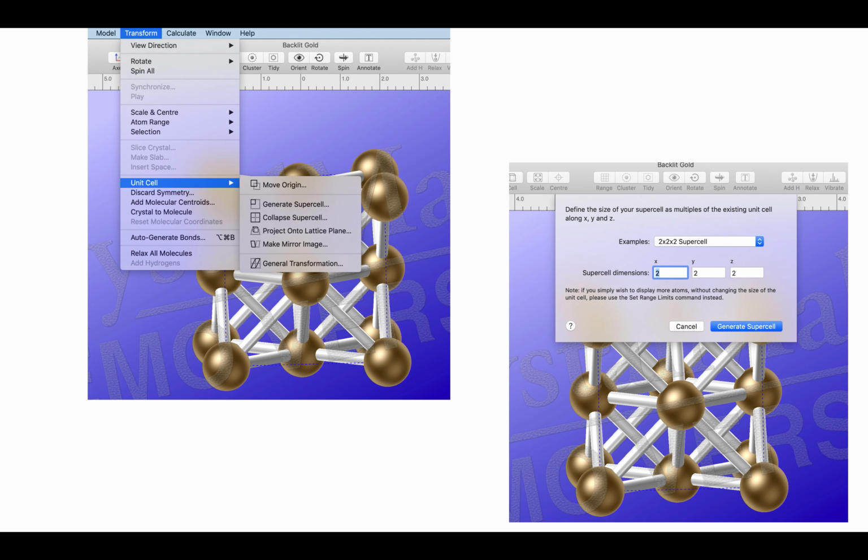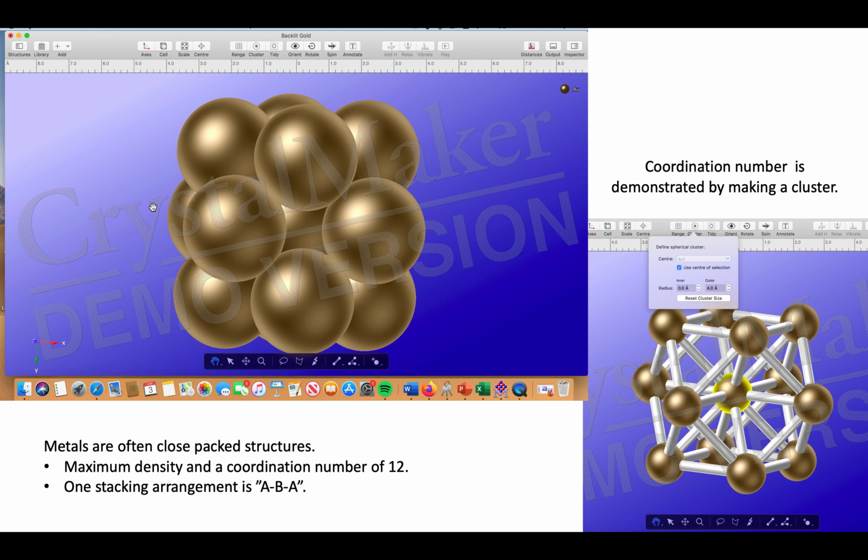I don't make it, well, let's go 10 by 10 right from the start. That's going to be crazy. But you can also then, of course, rescale it back.